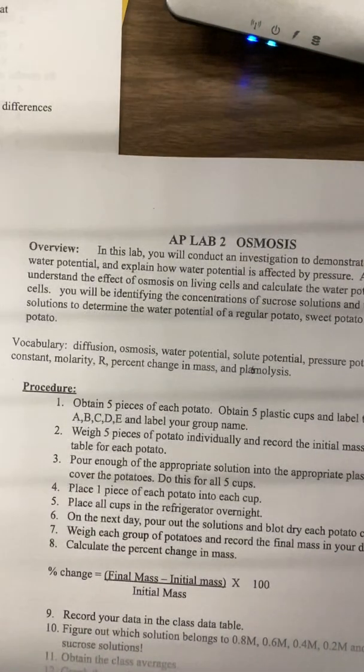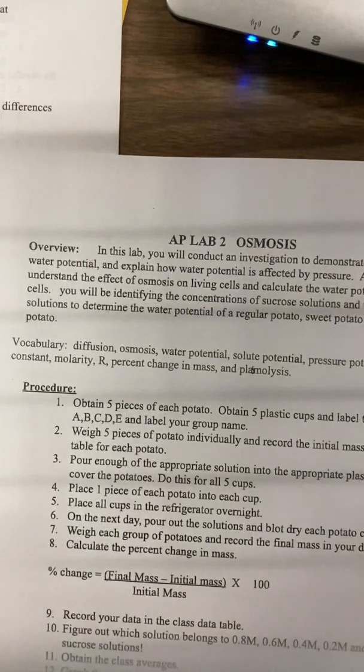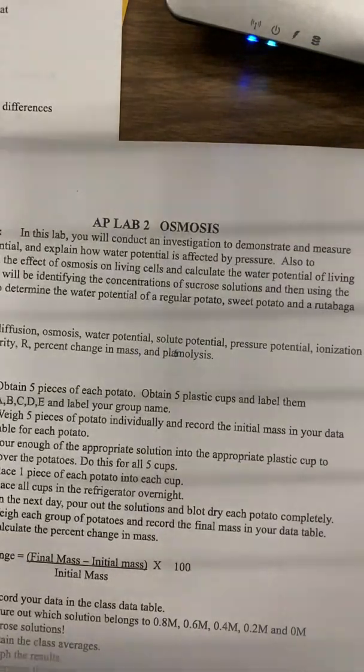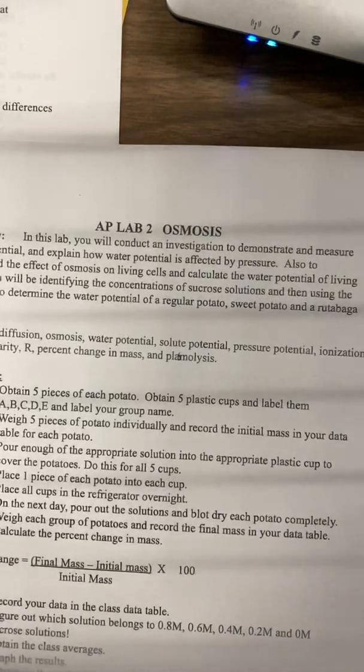Your background information is talking about water potential, and we're going to be using 3 different kinds of potatoes for this lab. You are going to figure out the water potential of a regular Idaho potato, a sweet potato, and a rutabaga. We're going to figure out what the water potential is, which means which one has more water or which one is most juicy, if you think of it that way.